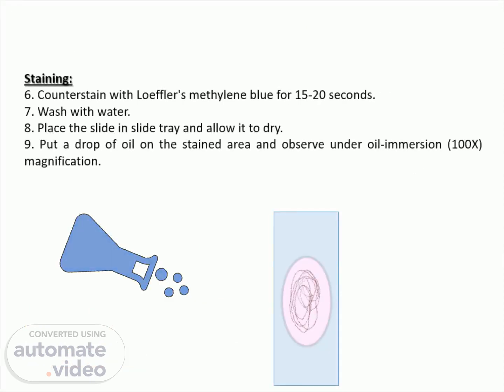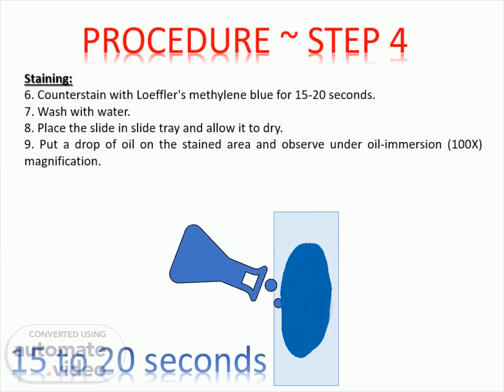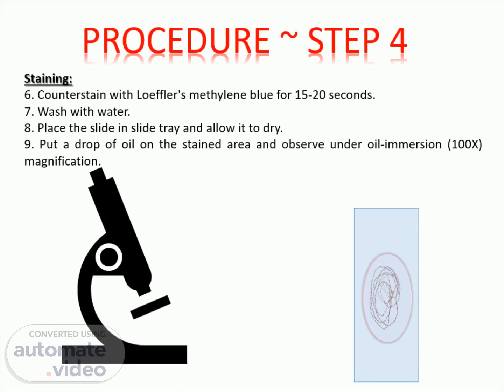Final step: counterstain with Loeffler's methylene blue for 15 to 20 seconds. Wash with water. Place the slide in the slide tray and allow it to dry. Put a drop of oil on the stained area and observe under oil immersion, 100x magnification.